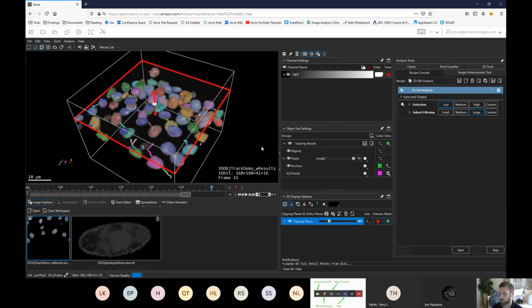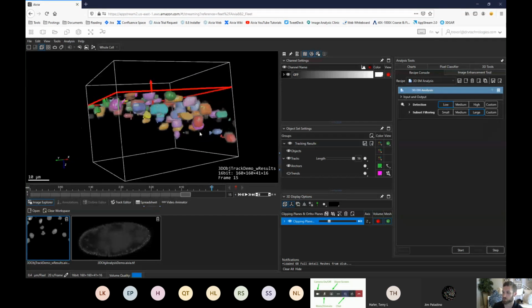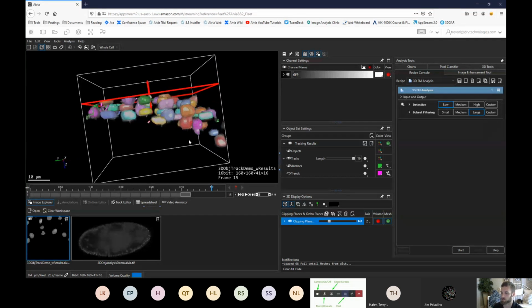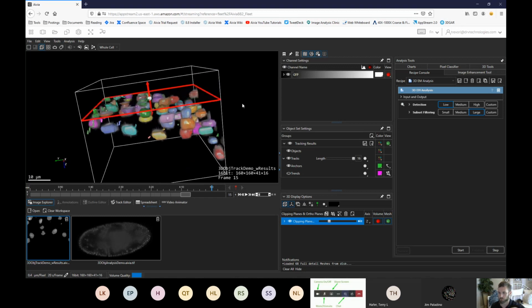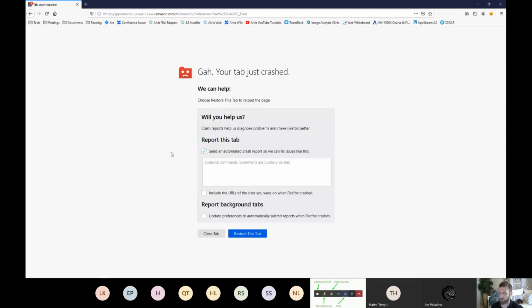Finally, for the axes, you don't always want to clip completely parallel to the axes. You can actually see in this data set, it's a good example because we've got this tilted row or this tilted plane of objects. And maybe we want to clip through them as orthogonally as possible. So I can choose one of the axes. Oh, nice.